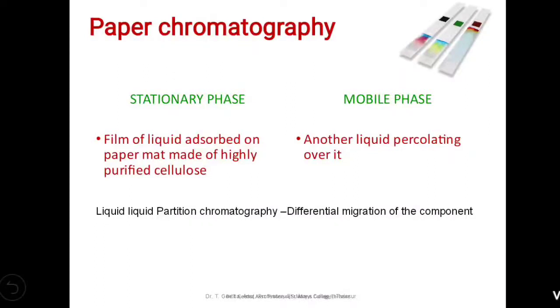Hello friends, welcome back to the lecture on chromatography. In this session, we will discuss paper chromatography. It is a technique in which analysis of an unknown substance is carried out mainly by the flow of solvent on specially designed filter paper.